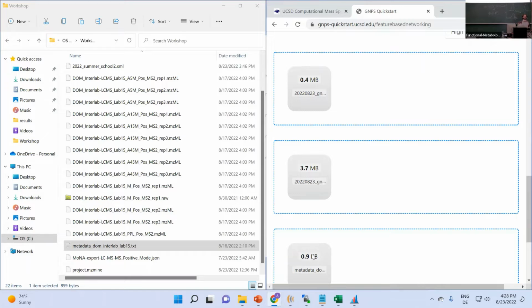So with the batch that I shared with everyone, we only exported a simple feature table where we only had very limited information. Some people that did it manually, maybe you have a file that also says CSV, but then quant full. Don't use this file. It's very complex. If you're going deep into features and you want to look at more information, you can use it, but you shouldn't have exported it, at least for this batch. So just a quant CSV.